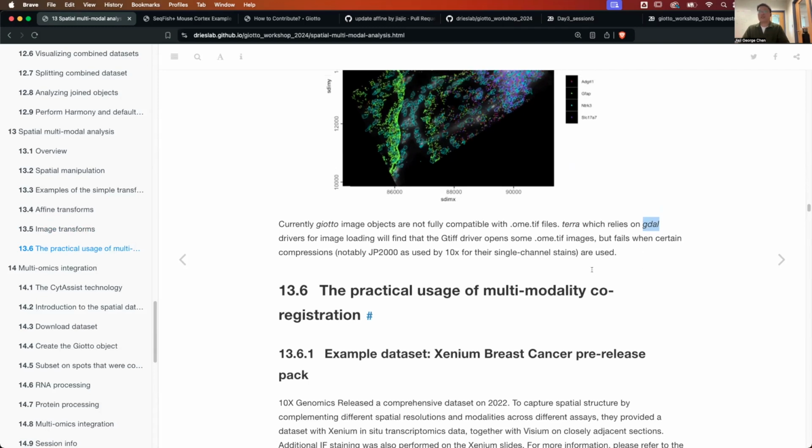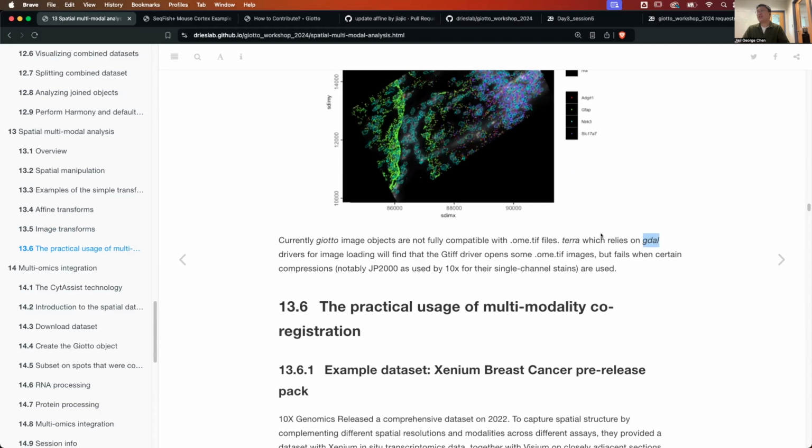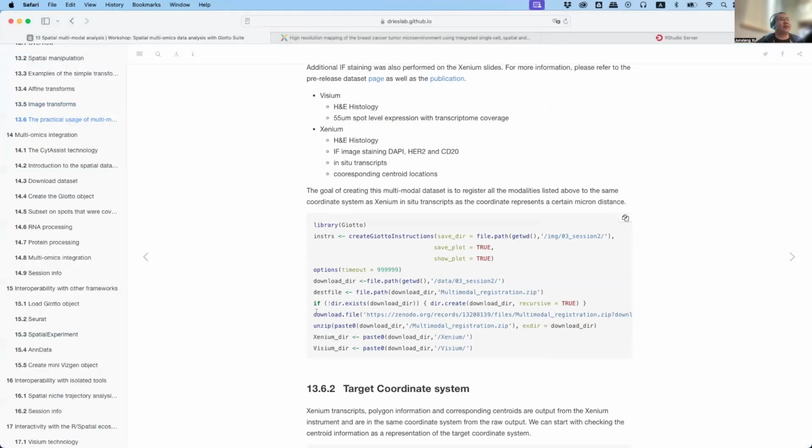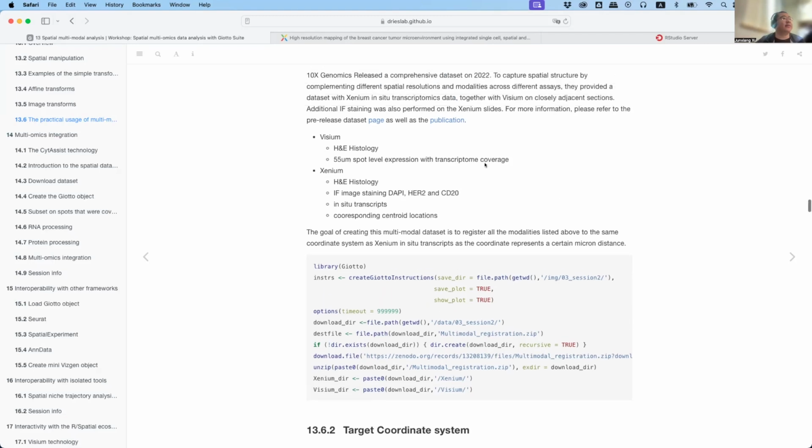And next is going to be Jingxiang, who shows you how to take all of this low-level stuff and apply it to a practical usage with actual aligning of multiple data sets. So before we start, again, if you haven't downloaded this Zenodo repository, please do so, because we did a lot of manipulation to the original dataset, and you will need those intermediate files.